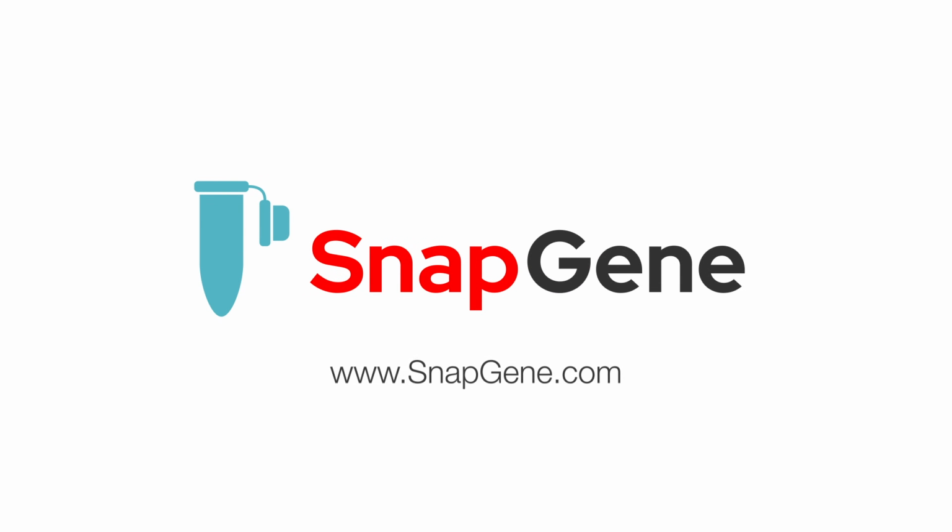For more information about simulating other cloning techniques in SnapGene, check out the other tutorials on the SnapGene website.